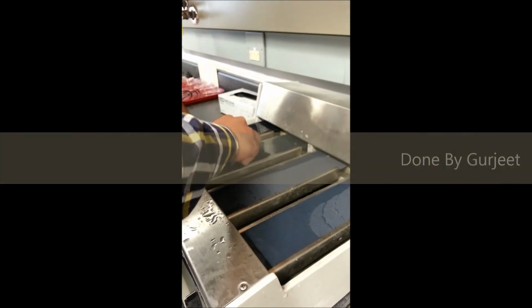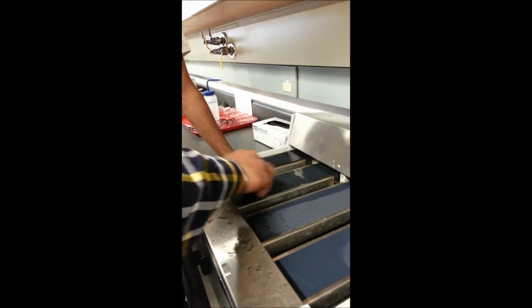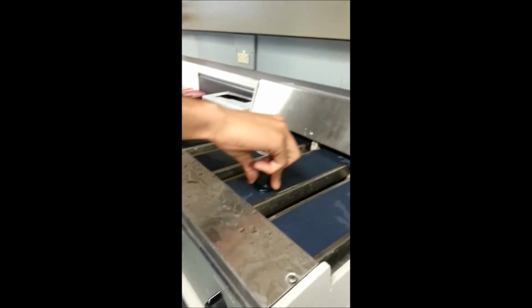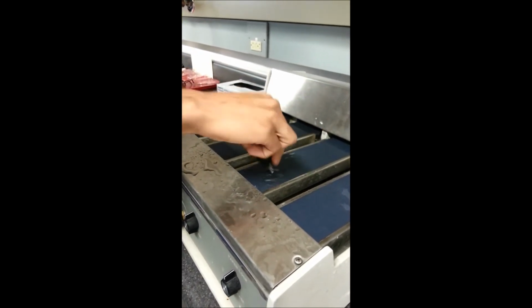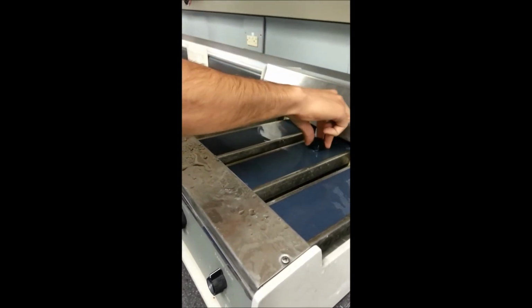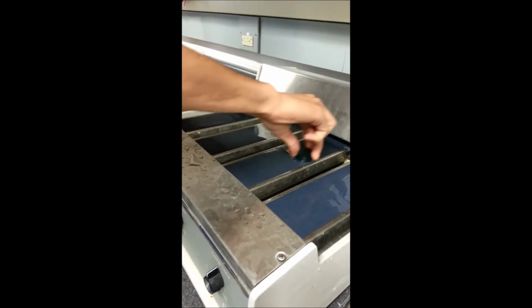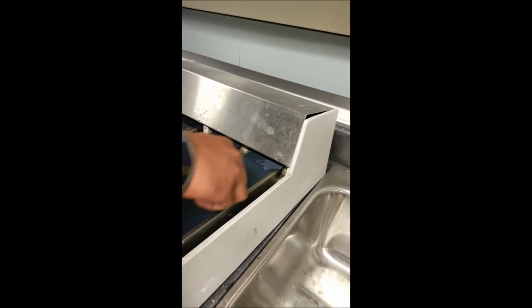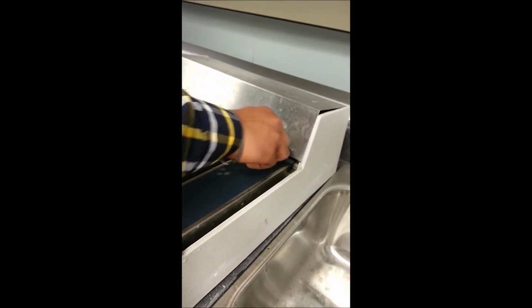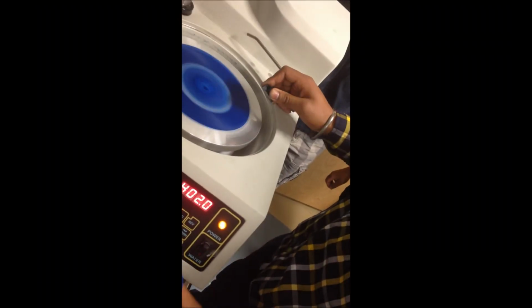After making the part, we ground the part on 3 pieces of paper: rough, smooth and smoother. And we slide the part on each paper in rapid motion and spend nearly 2 to 3 minutes on each paper, grinding the part very well. It's very helpful if we grind the part very well because it shows a very clean face on the part. And then we move on to the polishing material.